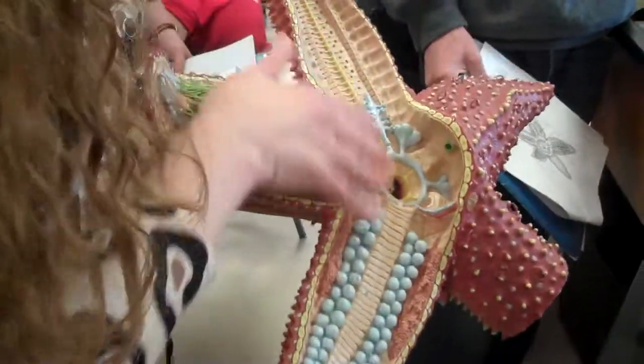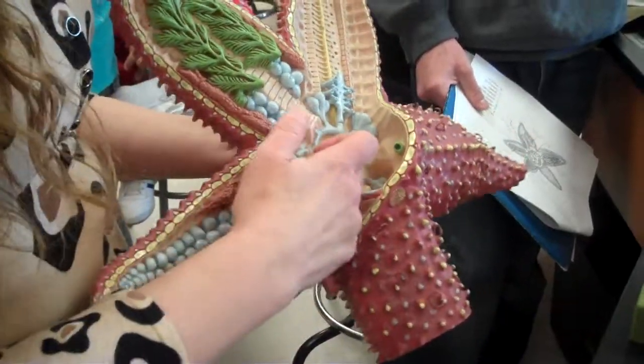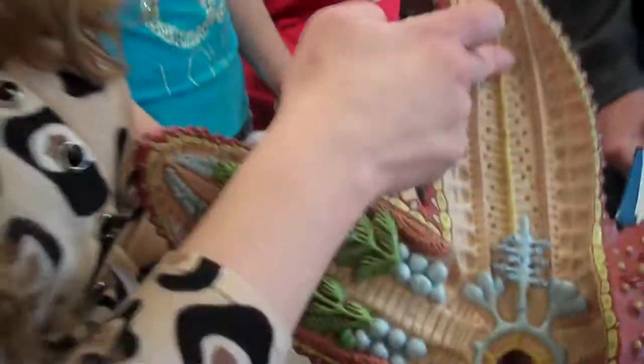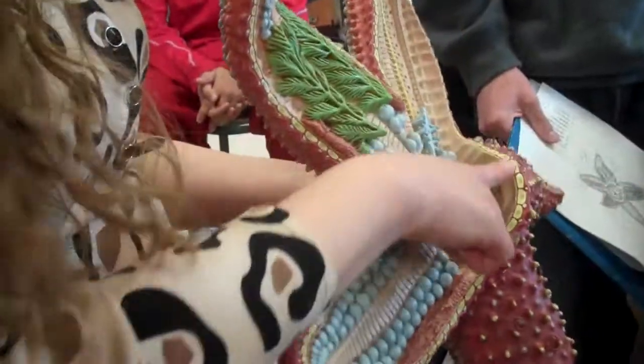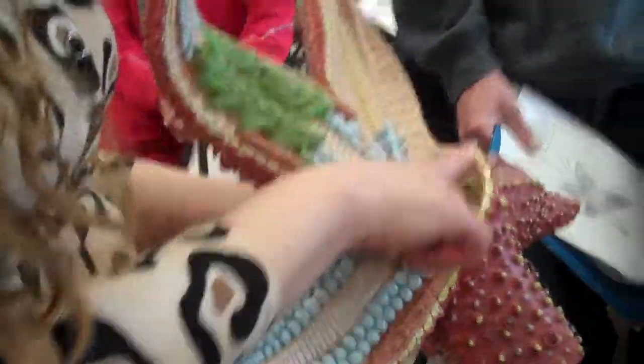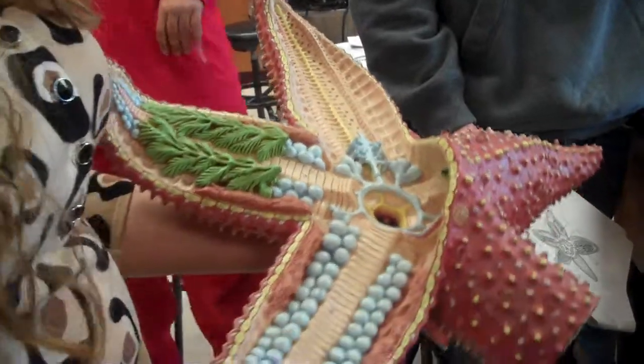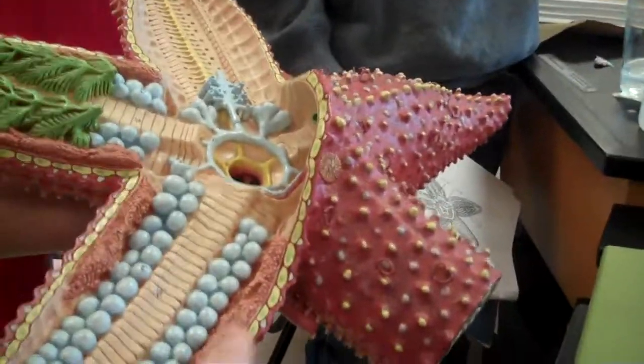Inside here, anything that's yellow is part of the nervous system. In the central disc you have the nerve ring, and then that branches down each arm into the radial nerve, which is also under the ambulacral ridge. The yellow things in the skin are the ossicles, and when they protrude through the skin, that's where you get the spines. These here are the gonads.